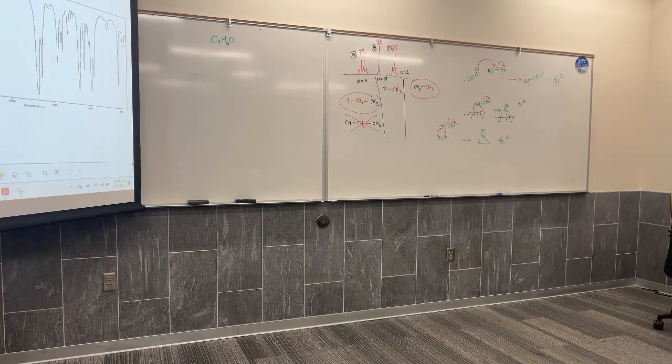By the way, which one is IR? Which one is NMR? So you guys can tell the difference between these spectra by now. They all look really distinct from each other, and that's important. You can see at a first glance what information you're going to get out because you know the technique. I want to give you guys just a few minutes to look over these and see what you can get.